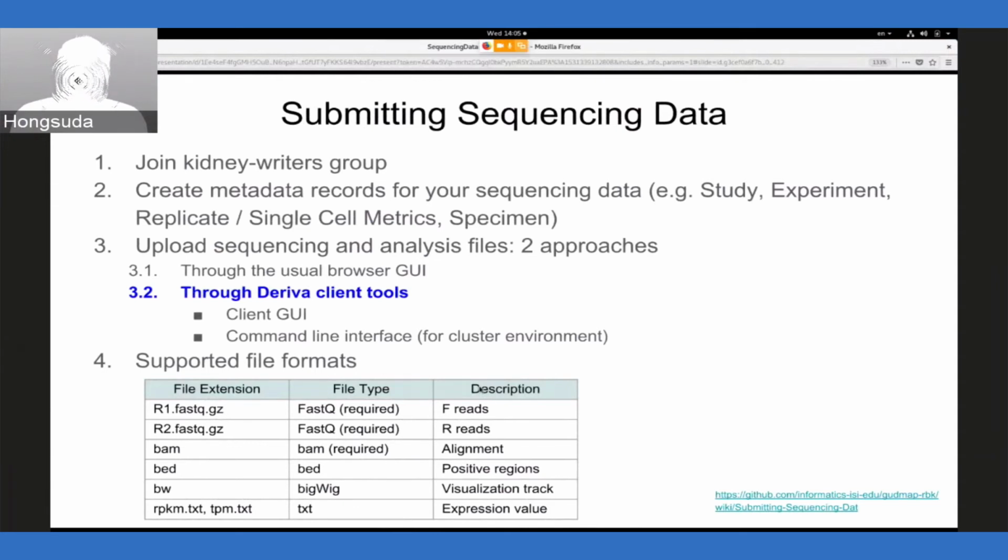No, I can change the file names, but if I'm an outside user who's gone to my paper and seen this, and I want to pull these files and rerun an analysis, I can't just pull the files and immediately run it. I have to pull the files and rename every file in this study that I want to run in order to do the analysis myself.